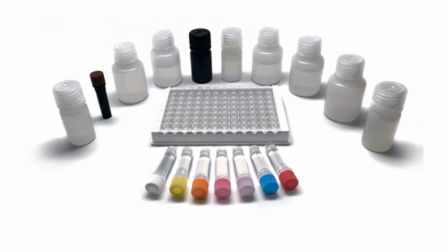In indirect ELISA, you can see here this is a kit. Suppose you want to perform estimation of any hormone, there is a kit for every hormone, with specific antigens and antibodies; the combination varies according to the type of estimation.